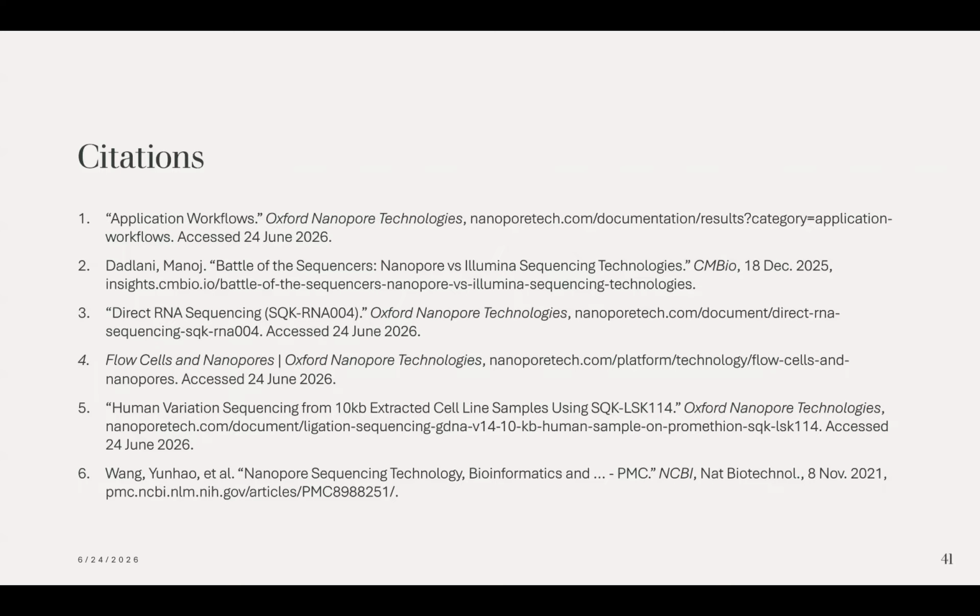So I think that's definitely a benefit compared to a send out. Off the top of my head, I think the genome core is about either 1 to 2K per lane, and I'm not sure. I think you can opt in for the other option, but I believe that is the default. So I think it averages out to about the 2 options.